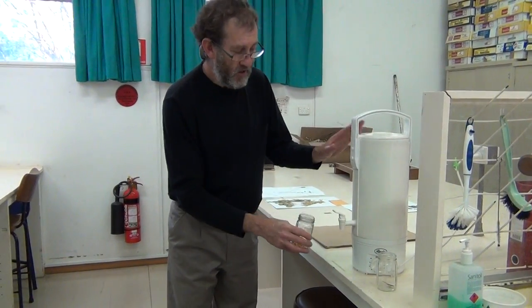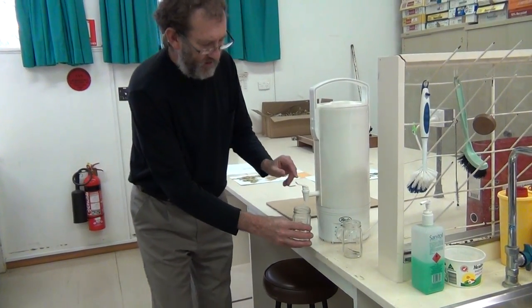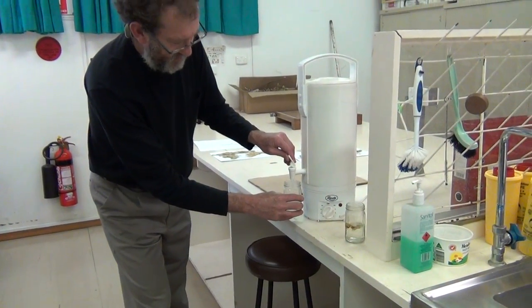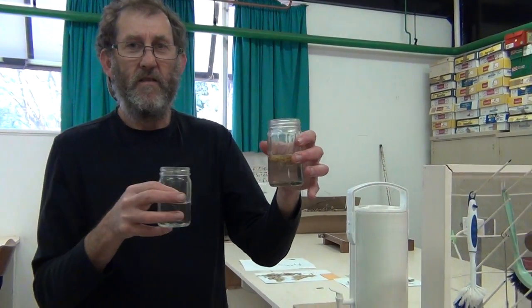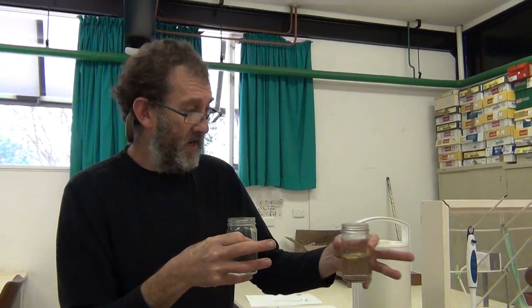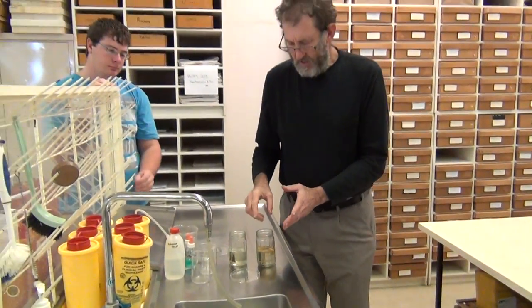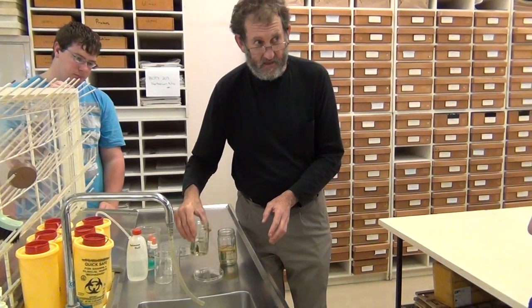Now we've got an urn with boiling water. I'm not filling the container right up — the main thing is to cover the material. The containers can get hot so just be aware of that. The beakers are more problematic because they transfer heat more quickly. You'll see that one specimen is floating and the other has already sunk — that's good.